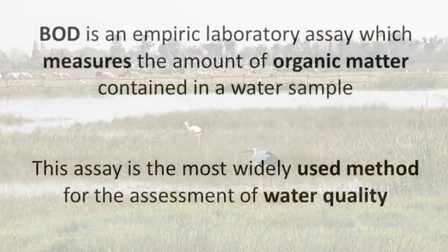The biochemical oxygen demand is an empiric laboratory assay which indirectly measures the amount of organic matter contained in a water sample. This assay is the most widely used method for the assessment of water quality.